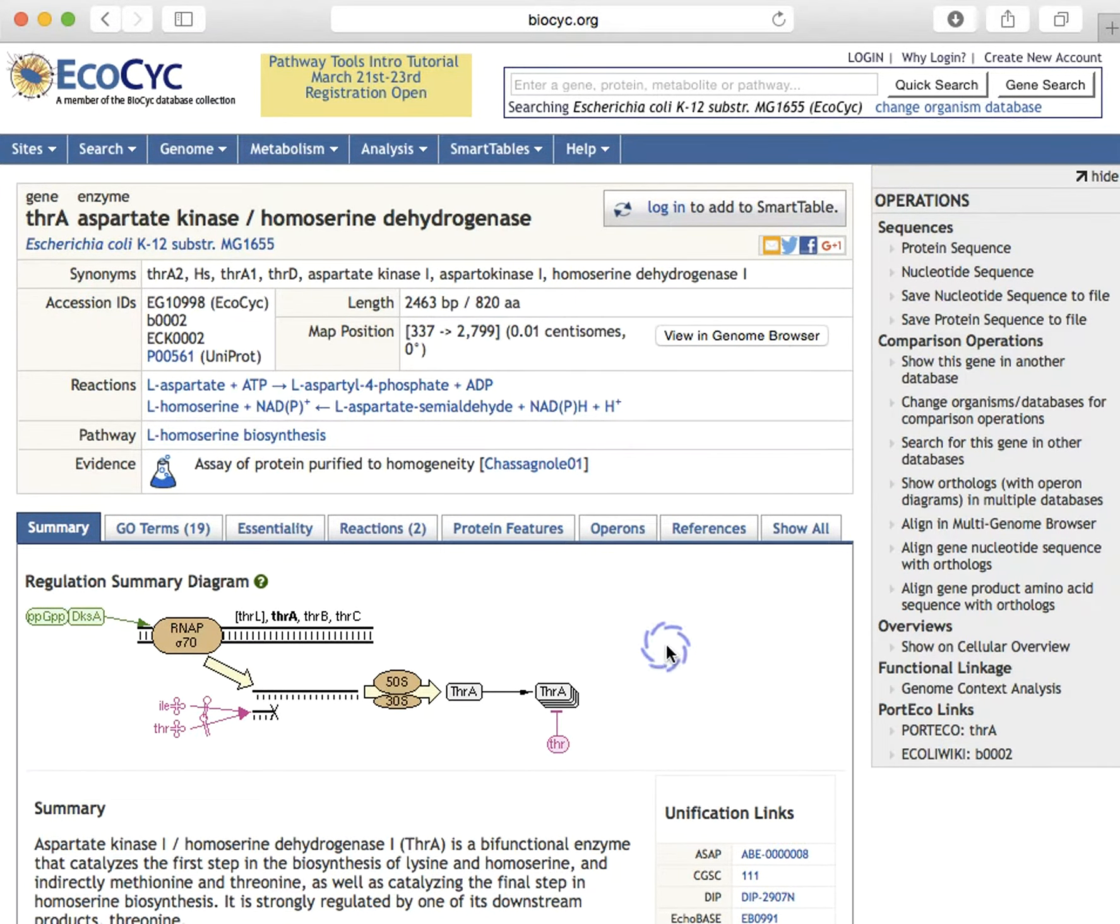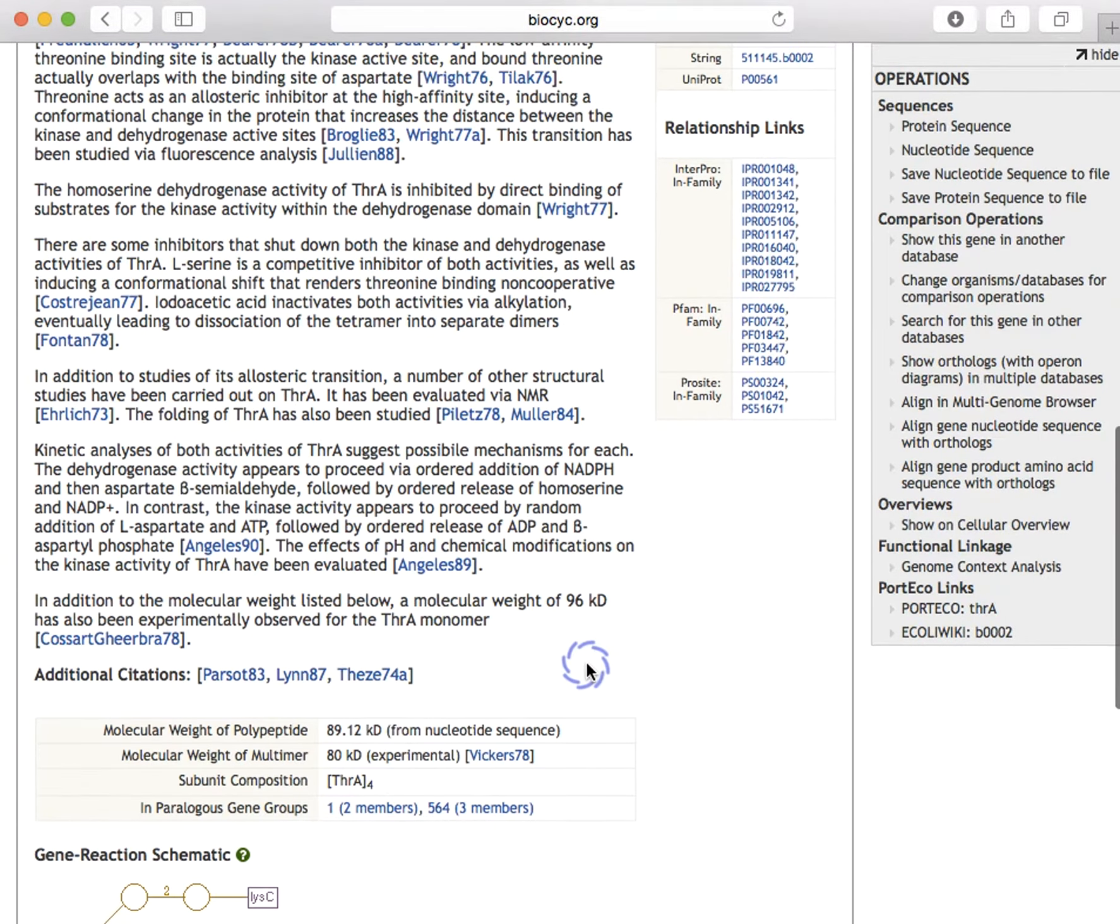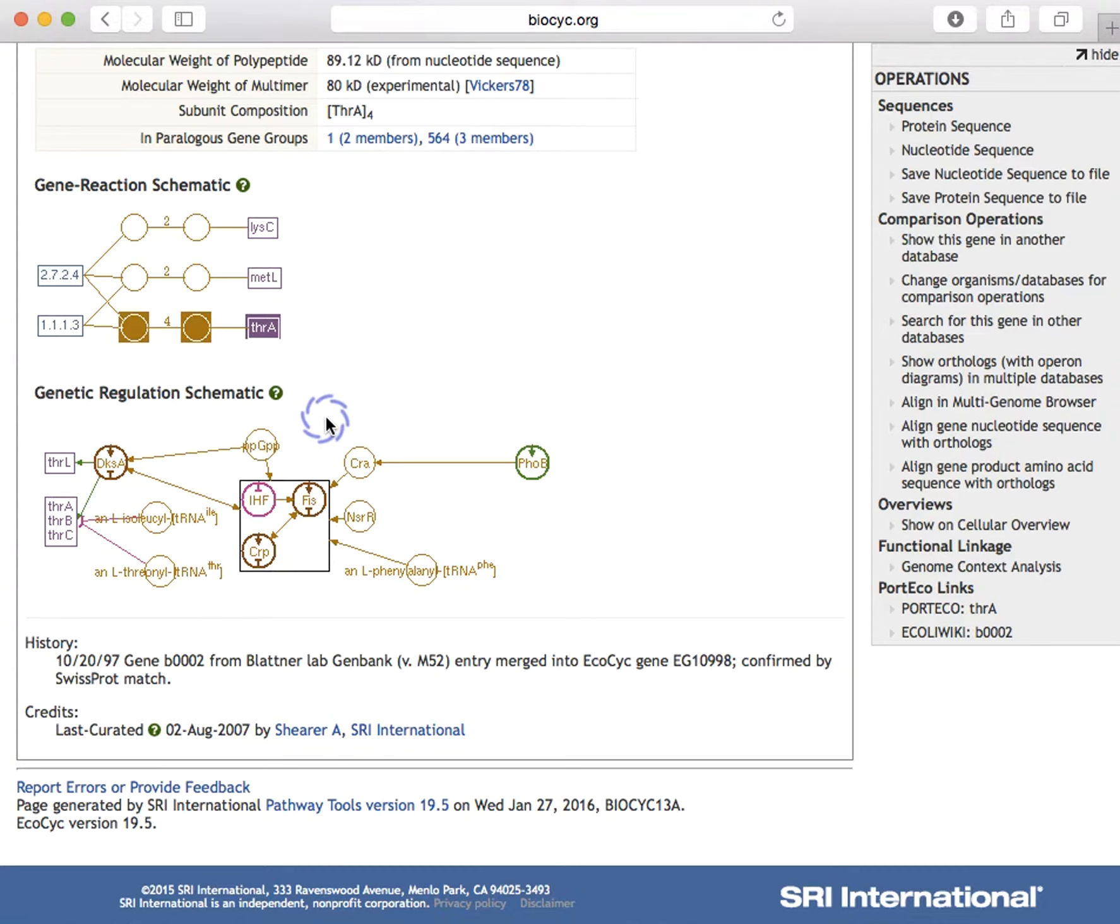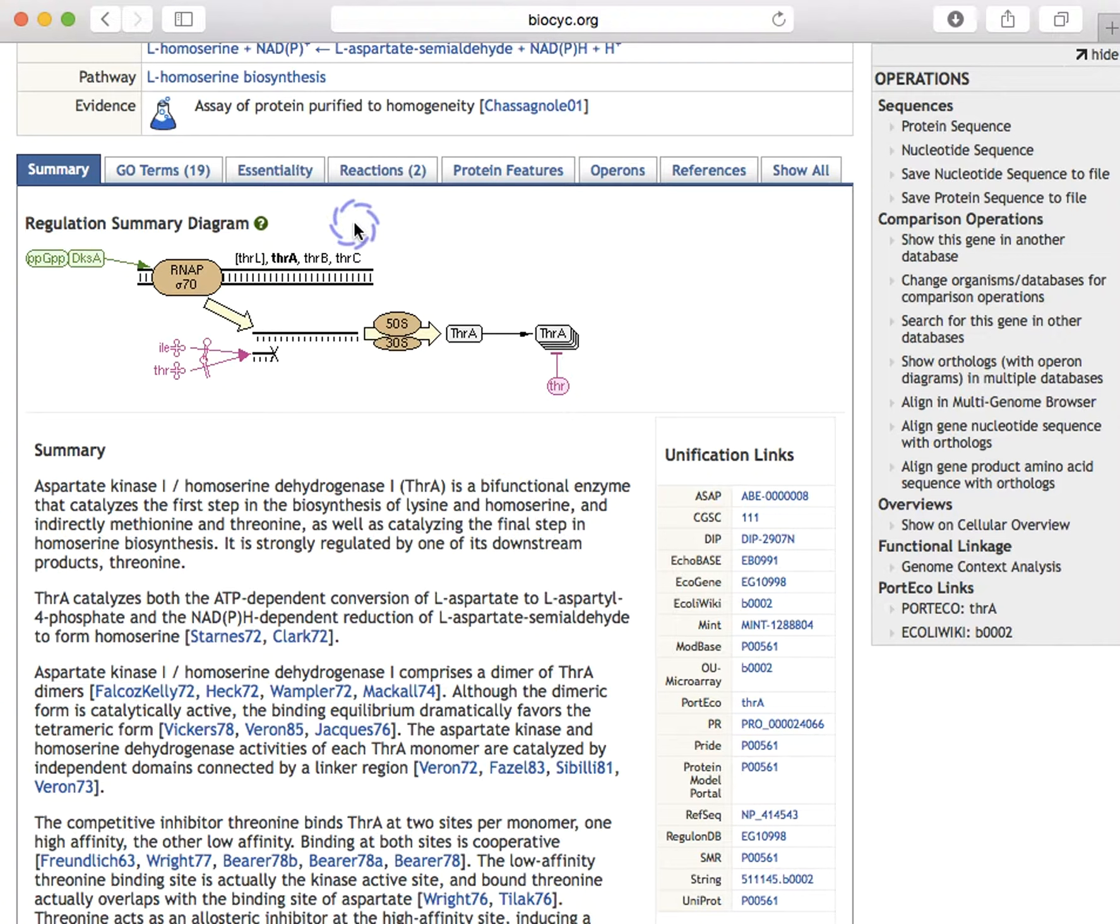Database links are also present in the summary pane on the right here, as are these two diagrams toward the bottom, the gene reaction schematic and gene regulation schematic, which will both be explained in more detail in subsequent webinars. To make it easier to find additional information available for a given gene, we have organized information into these additional panes accessible through these tabs.